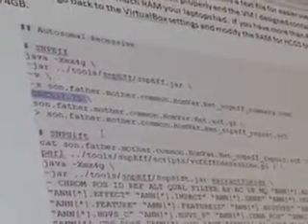So you don't want to go and align to 37.64 because it might not be in SnpEff, and then you have to come back and find 37.75 or whatever. This is the latest. This was the last HG19 one that SnpEff created, and now they go into the GRCh38.